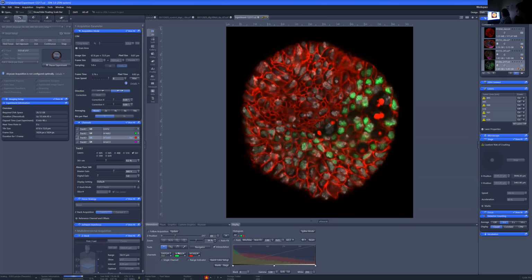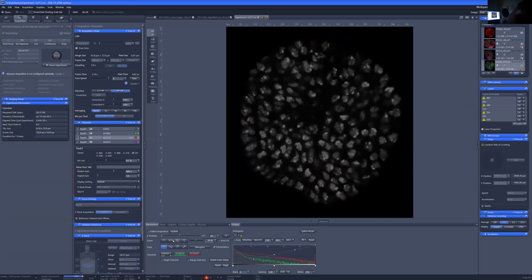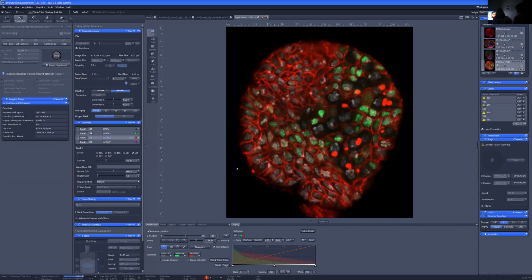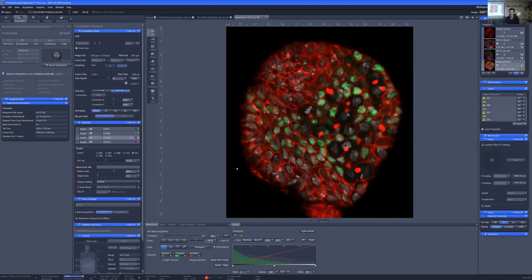There was one time for a period of a couple of weeks, I think, where you were really pushing the microscope to its limits in terms of taking the thinnest possible slices. Yeah. And for a while, things just weren't aligning, right? Yeah. How many weeks do you think that was? It was on and off, but I think it was probably 6 weeks in total where I just couldn't do any experiment. And it was horrible.